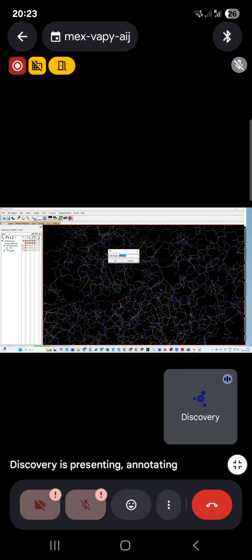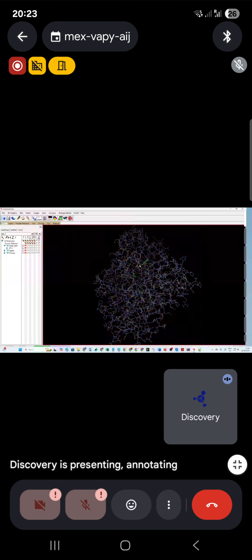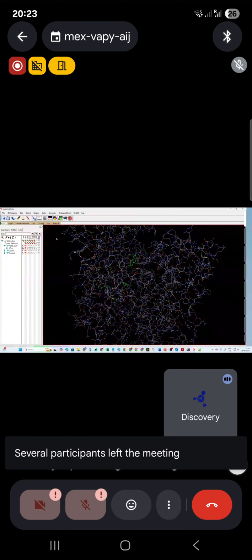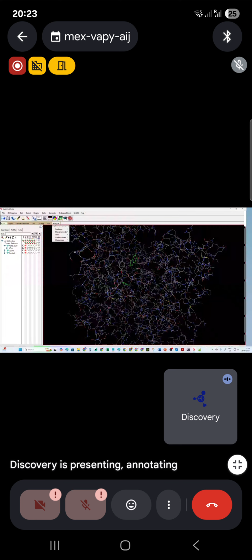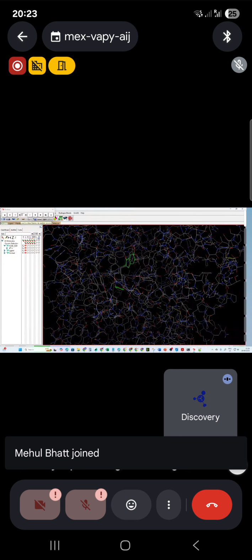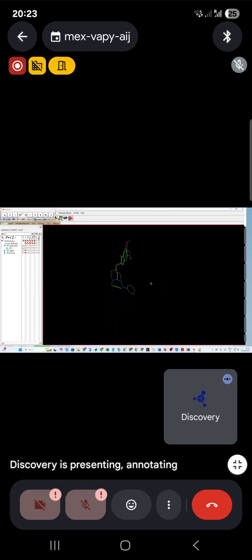You can change the name of this ligand. It doesn't matter, but let's call this docked. That's okay, you just click OK. Now I want to see the different conformations. If I go to Analyze again, go to Conformation, and then click Play, see, this is the first conformation. I'll just hide the receptor, so it's better now.